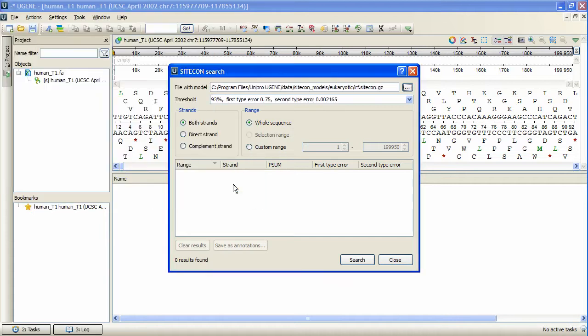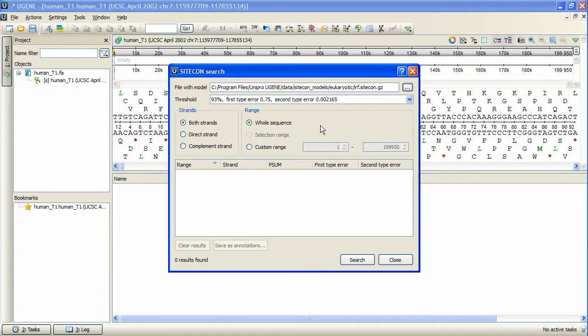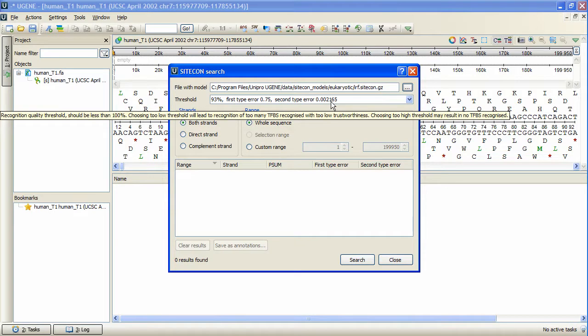When the model is selected, the threshold filter is populated with a set of available thresholds, read from the profile.